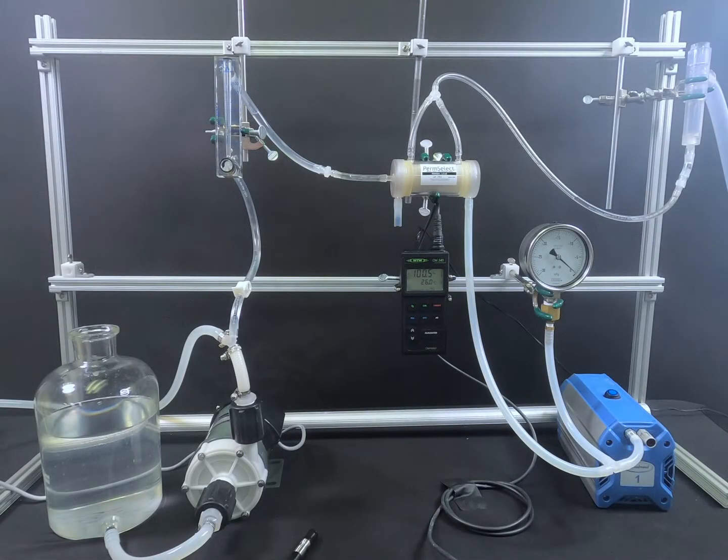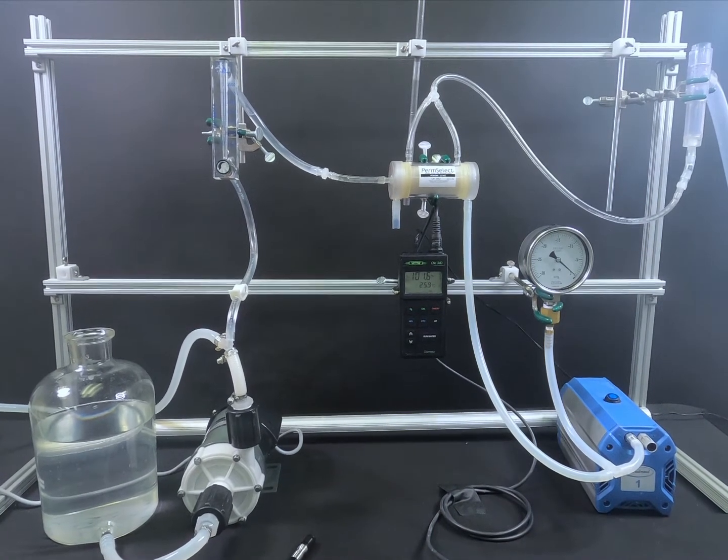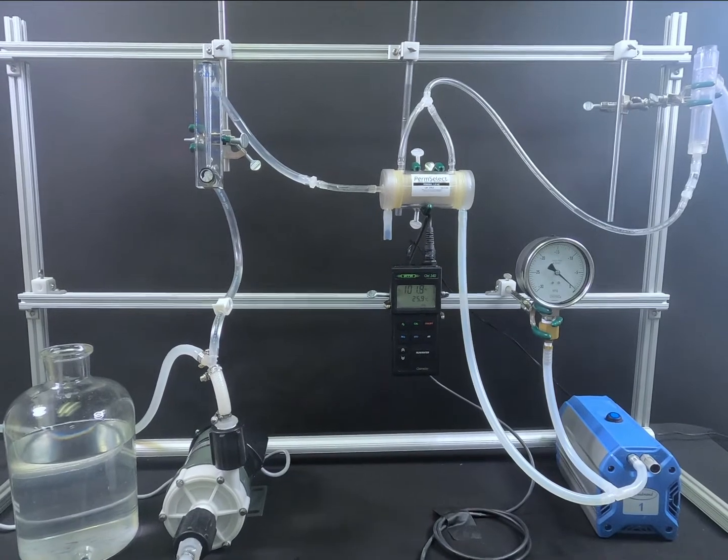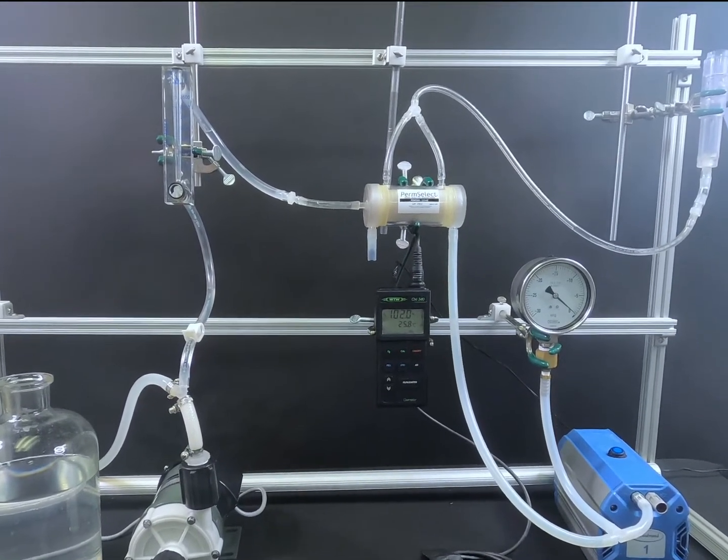For this demonstration, we will be examining the process of degassing oxygen from water using our PermSelect PDM-SXA 1.0 membrane module with a surface area of 1 meter squared.